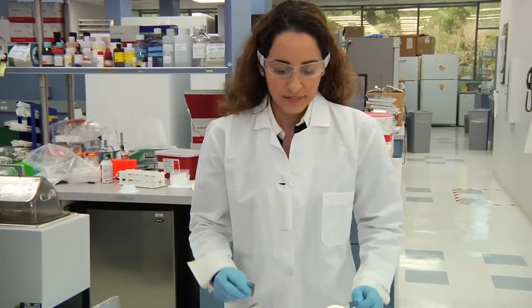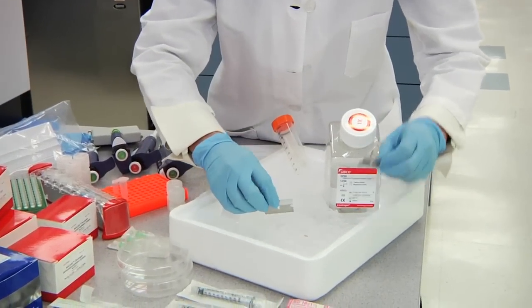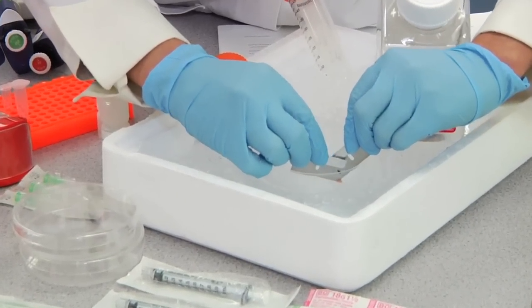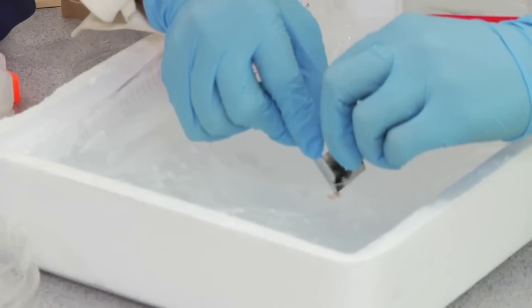Step two: mincing the tissue. First remove any necrotic or fatty tissue from your sample. Then you're going to mince the tissue using two razor blades into less than one millimeter cubed pieces. All of this is done on ice and in 250 microliters of 1x PBS. You're going to want to cut your tissue into less than one millimeter cubed pieces using the two razor blades.